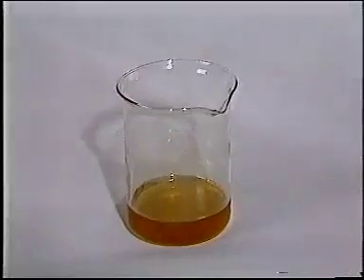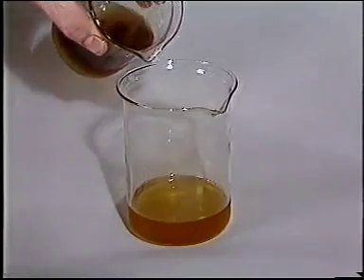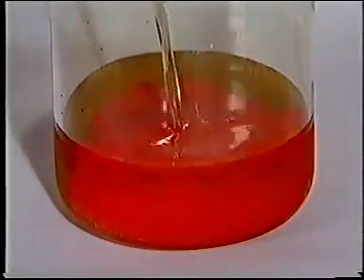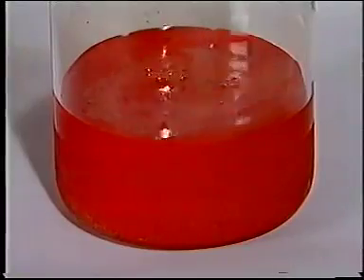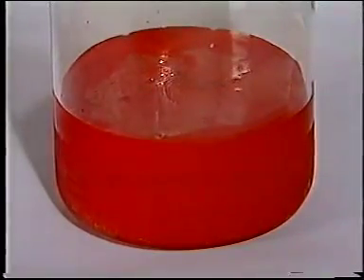A reaction you will meet in Unit 10 is this one. If 2-naphthol is added to benzene diazonium chloride at a temperature below 5 degrees centigrade, then a bright red dye is formed.